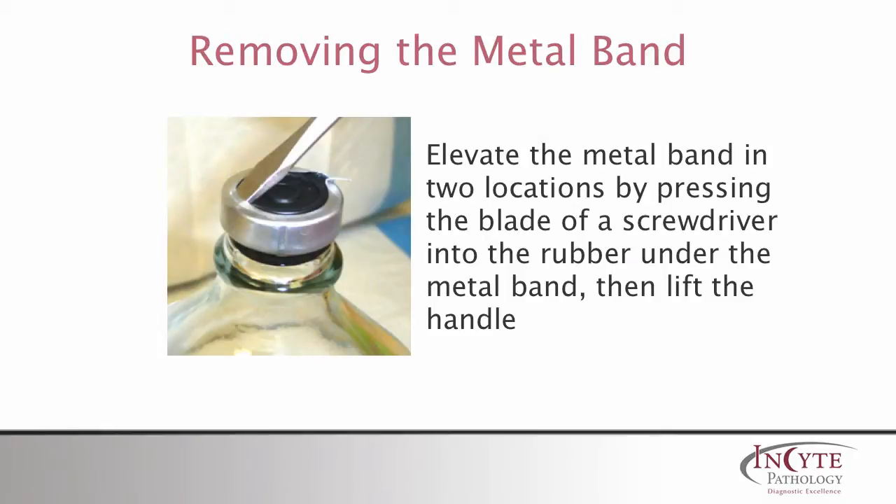A sturdy flat-headed screwdriver can be used to lift the top section of the metal band on two sides. Carefully slip the screwdriver under the metal band lip by pressing the tip into the rubber, then lift the handle of the screwdriver up enough to bend the metal band.